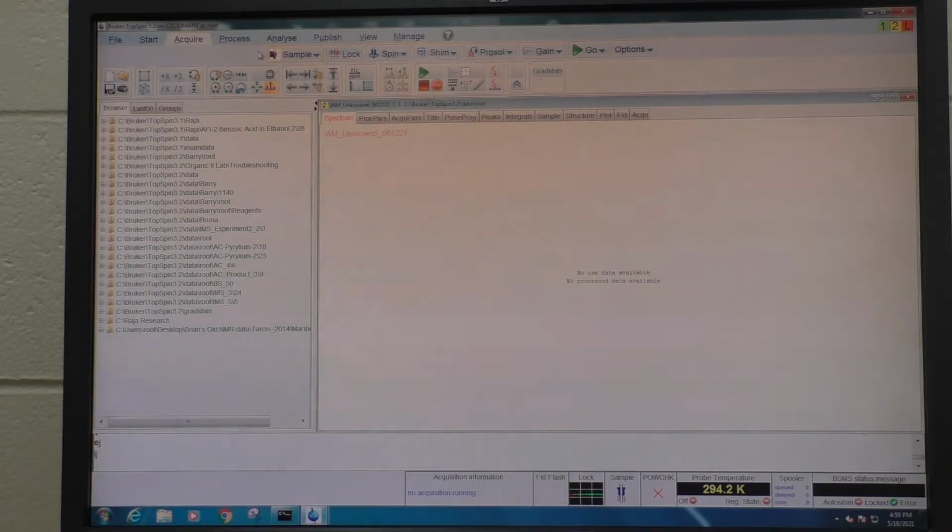And now the way that I take spectra is simply by working my way left to right across the buttons that are provided here. Now, although the particular order of the buttons and the particular display on any given spectrometer or instrumentation may be slightly different, these are still the same steps that you want to follow regardless of the particular software. So first we have sample.